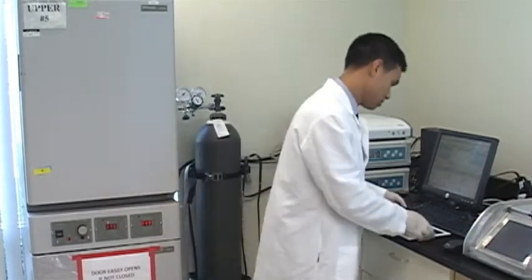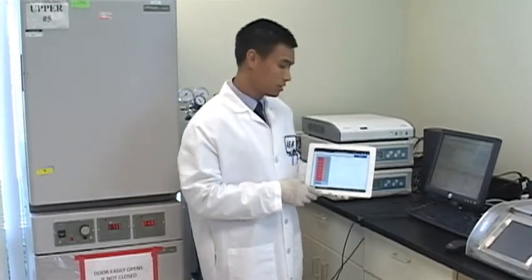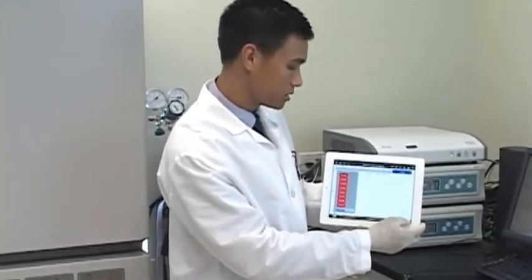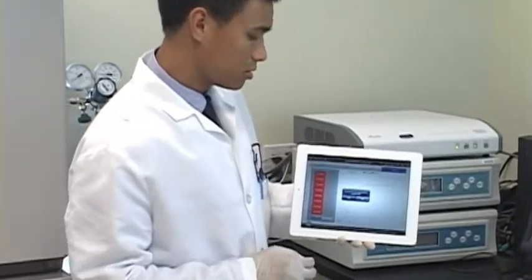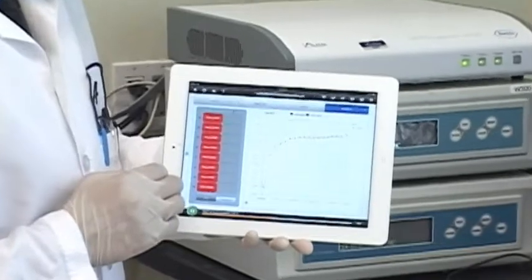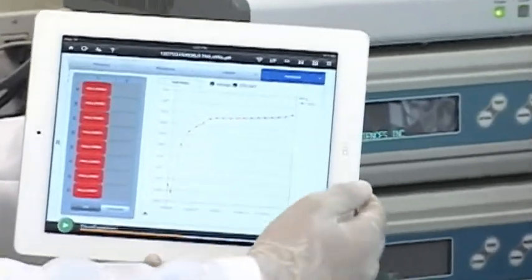So from here, since we're ready to add our compounds, I'll be taking the E-plate out and putting it in underneath the tissue culture hood, adding it there, and then bringing it back. And so from here, we're actually ready to abort this current step. And so it'll prompt you to confirm that you actually want to abort the step. Yes. And from here, you're actually ready to take the plate out from the station.